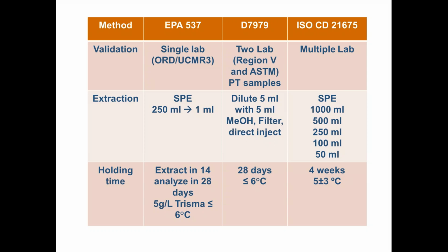Contrary to ASTM's own rules, there was never an interlaboratory study or multi-lab study conducted on this method. The draft ISO method does have an interlab study. Both the EPA and ISO methods extract PFCs from water samples using solid phase extraction, or SPE.